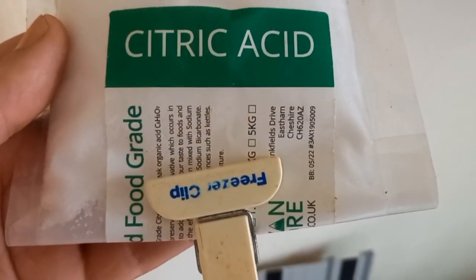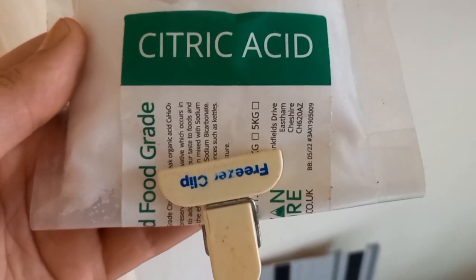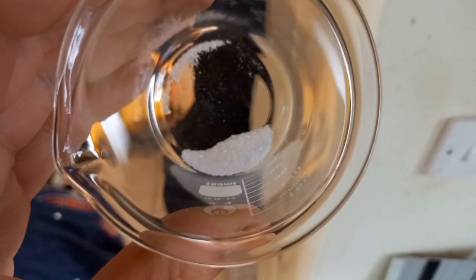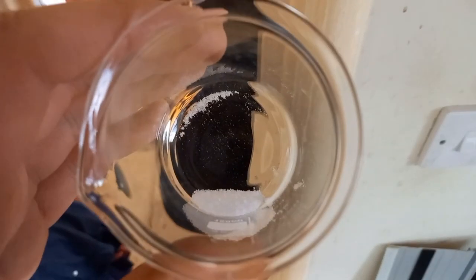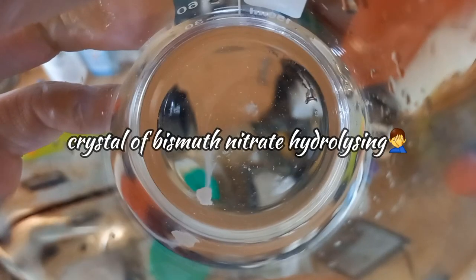What I am going to do is see if citric acid will help me to dissolve bismuth nitrate without it hydrolyzing. That could be oxynitrate — yes, it appears to be.